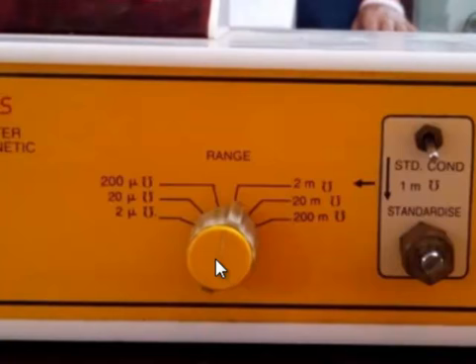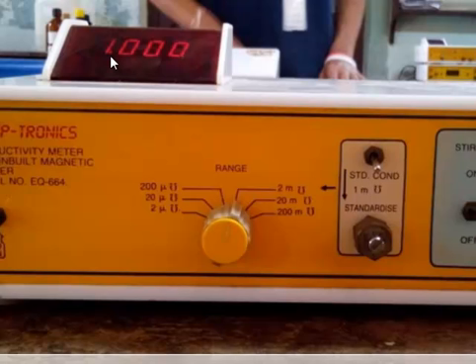However, the solutions that we use for our regular titrations have conductance in the millimhos range, and hence we will be taking a reading at a range of 0 to 2 millimhos, or 2 to 20 millimhos, or from 20 to 200 millimhos. This is a switch required for standardization of the conductometer. As you can read clearly here, when you put the switch down as indicated by this arrow, the standard conductance will be 1 millimho. Since this switch is already down, it is 1.000. So 1 millimho or 10 to the power minus 3 mhos.